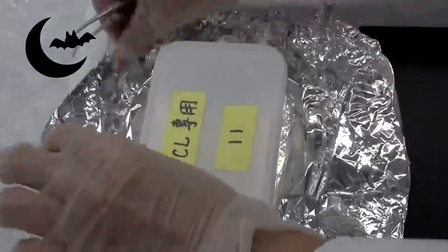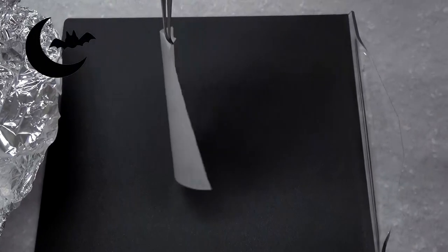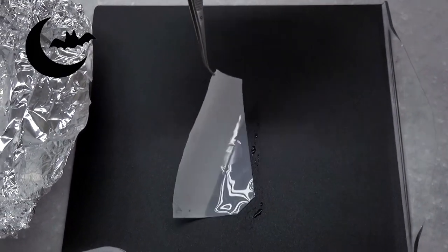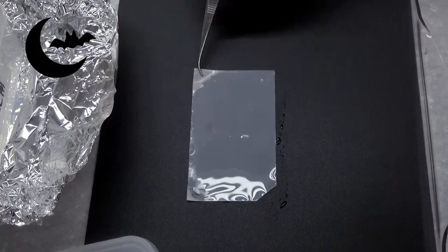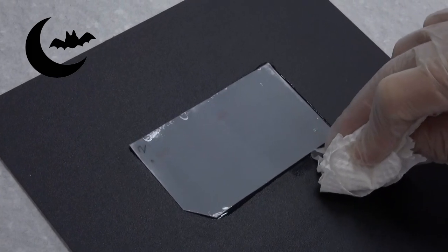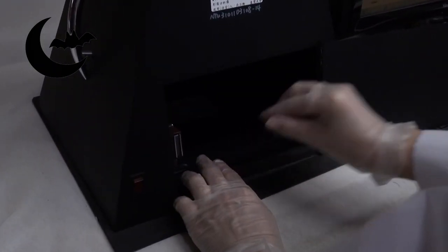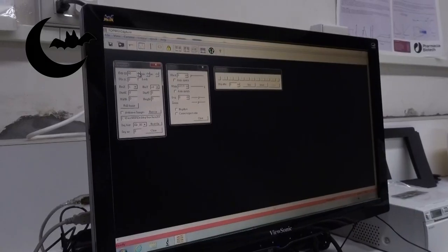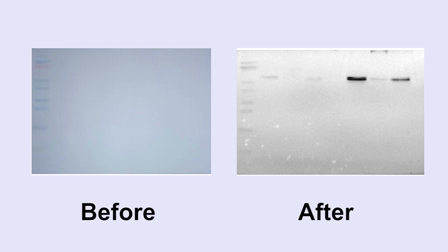Open the lid after the reaction and quickly pick up the membrane with tweezers. Drip a few drops of ECL reaction solution on the black supporting plate and place the membrane on the plate with the labelled side facing up and the cut corner to the lower left. There must be no bubbles between the membrane and the plate. Wipe clean excess reaction solution around the membrane with chem wipes to avoid interfering with signal detection. Quickly push the plate into the imaging system to take pictures before the reaction signal declines. The amount of protein transfer, the titer of the antibodies, and the time for operation can all affect the exposure time, which usually ranges between 30 seconds to 300 seconds.